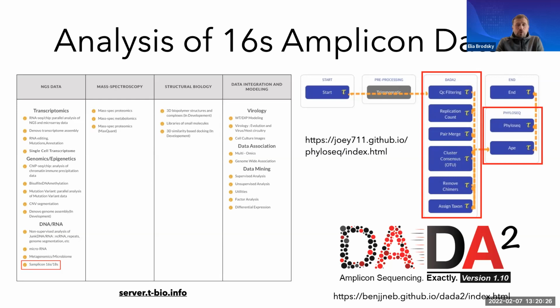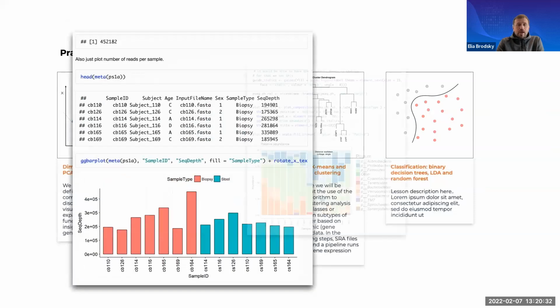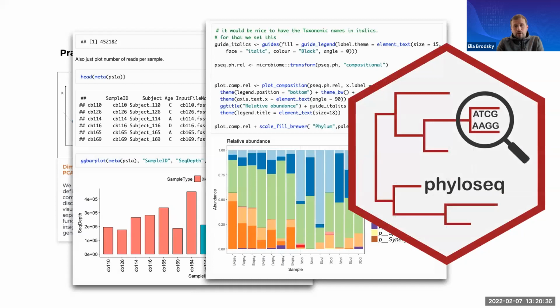As we go into all of these different methods, you need to see that there are many different alternatives to those methods. What we'll see today is a package that we will briefly take a look at called phyloseq in R, which will be useful for different types of visualization techniques that are standard for this one type of metagenomic sequencing data that we will review today.